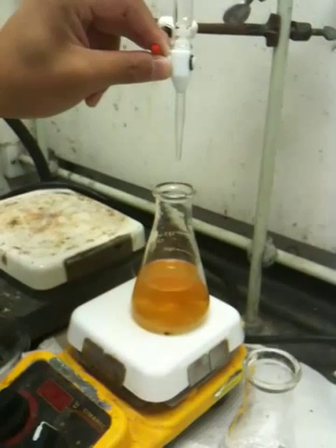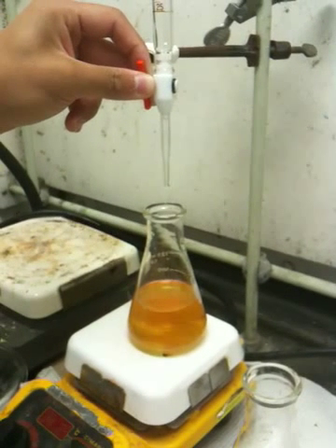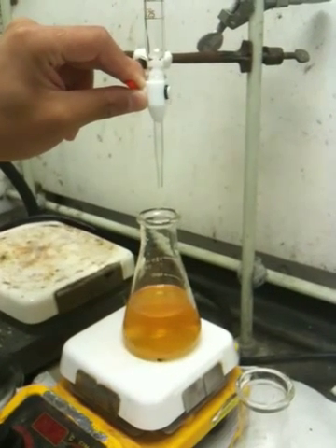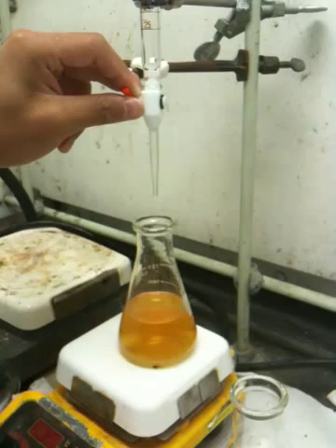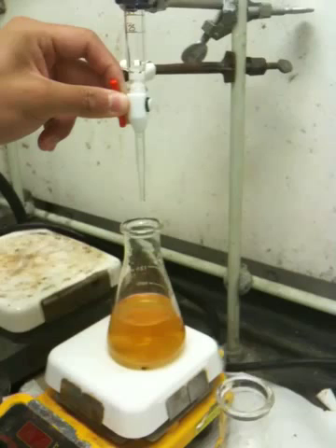Oh, and inside that flask, that thing swirling around is a magnetic stir bar — yeah, it's pretty cool. He's being very cautious because he doesn't want it to go completely clear, or else he's something we call S-C-R-E-W-E-D. Screwed — which happened to him last time.